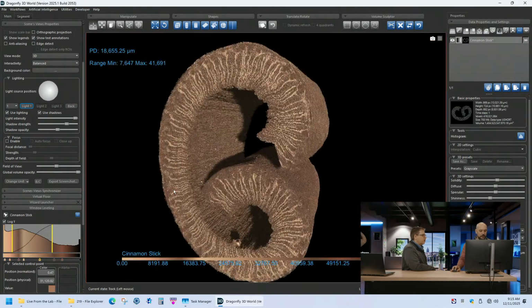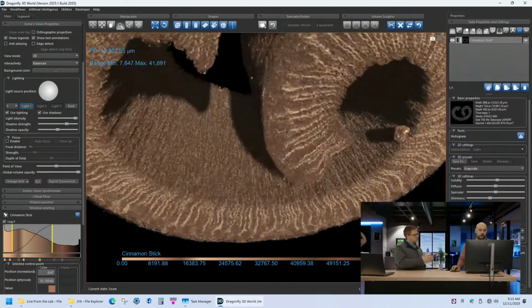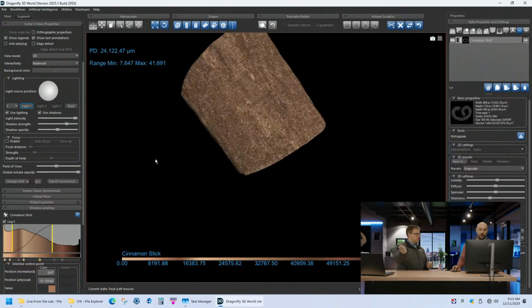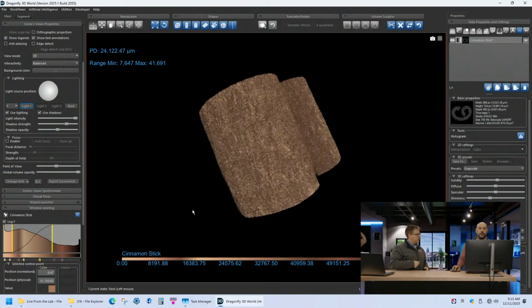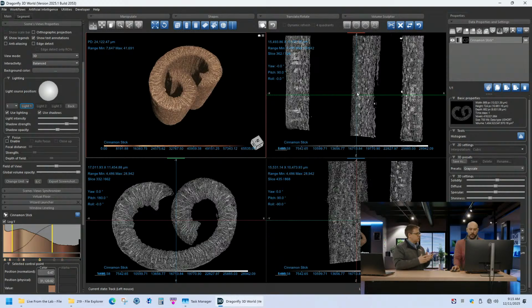So it's pretty cool. Now, I know in some software you can do cuts. That's very important, right? Because otherwise this is just like one of those laser scans where you only scan the outside of the object. But here, what's unique is that we actually have all the info about the inside. So how do we do that?